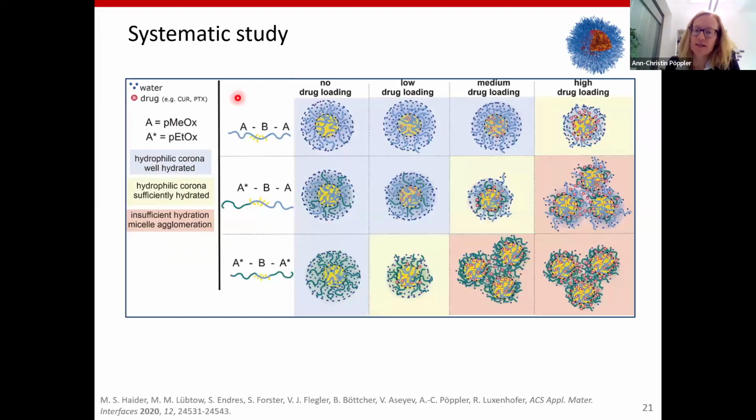And in this case, the resulting picture or idea that we got from the studies, also at high loadings, is that kind of a jelly is formed, so that some of the material is also precipitating. And we could, for example, observe for 3 different polymers and different amounts of drug or gas molecule inside that we have states in which all the signals are nicely present, where everything in the particle is well hydrated.